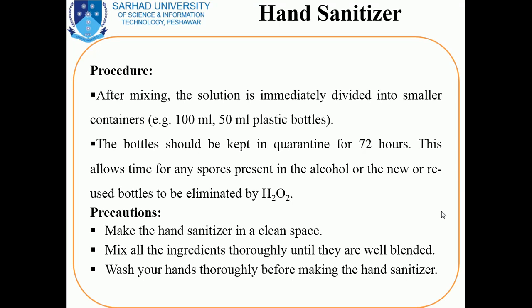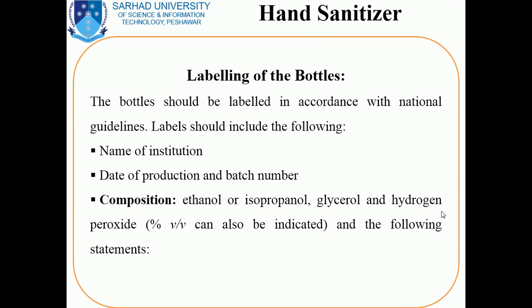And the third one is to wash your hands thoroughly before making the hand sanitizer. If you are preparing the hand sanitizer, you should clean your hands, wash your hands thoroughly before making the hand sanitizer. These are the precautions to be exercised prior to or during the formulation.